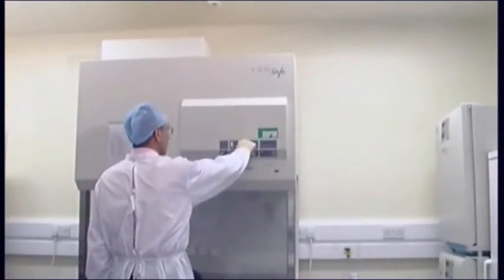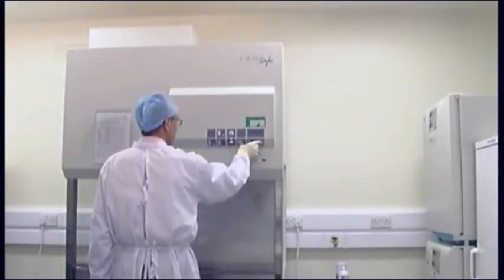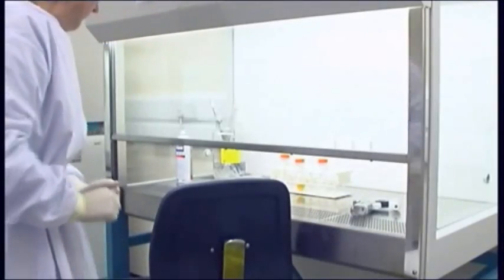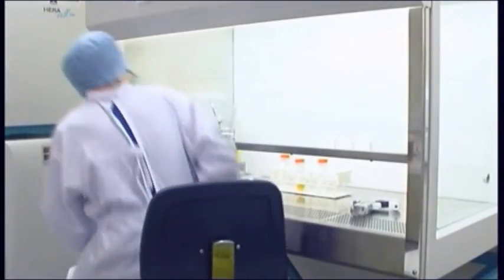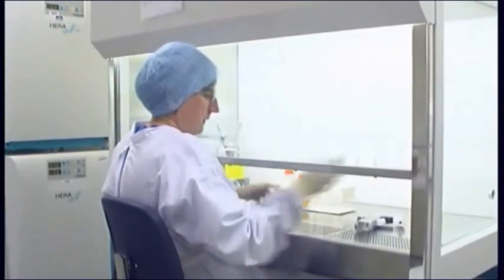Turn the safety cabinet on 10 to 15 minutes before you start working to allow the air flow through the cabinet to stabilize. Ensure that the cabinet is clear of all unnecessary items, spray with 70% alcohol solution and allow to settle before starting work.